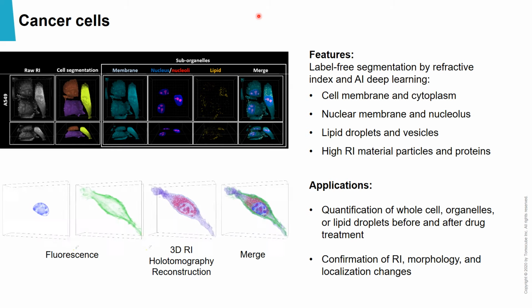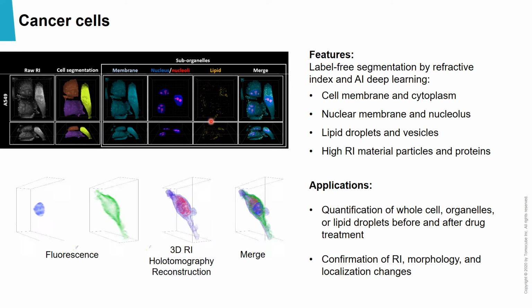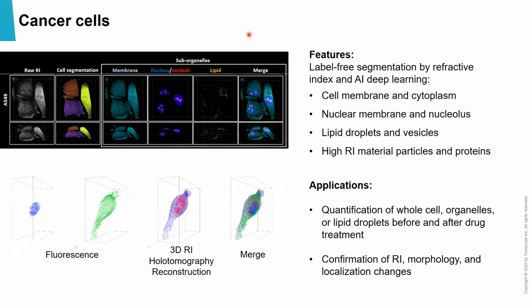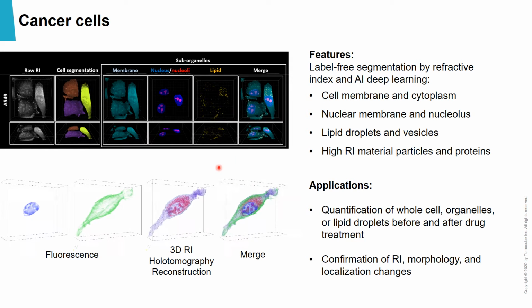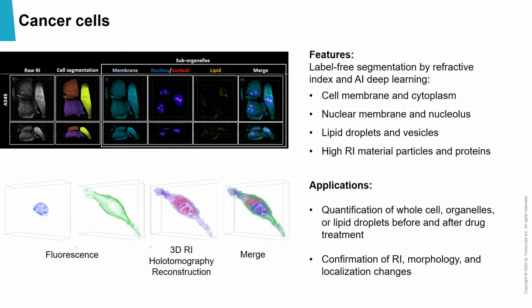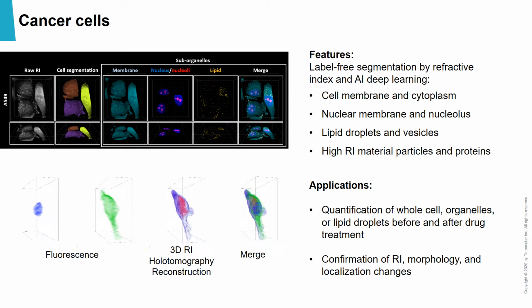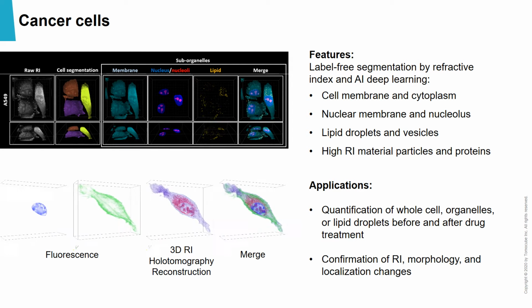Also, you may be wondering, what if you wanted to measure the molecular specific information addressed by fluorescence microscopy and also want correlative imaging for certain information? We can also image HT with correlative fluorescence, so we can capture the hologram as well as the multi-channel, 3-channel fluorescence data. Although using fluorescence seems like it defeats the purpose of label-free HT, fluorescence can provide specificity while HT provides the quantitative and structural information, so they produce a synergistic effect as each provides complementary information.